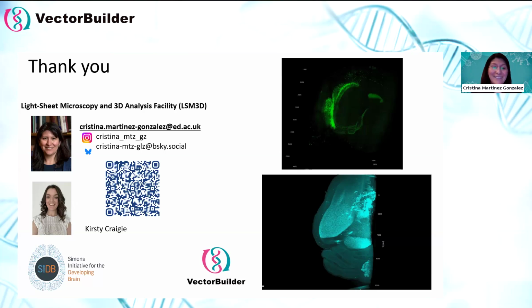Yes. Awesome. The next questions are a bit more general. Are there any common mistakes you see labs make when they first start using tissue clearing that significantly affect image quality or reproducibility? I would say obviously fixation. Start with a good tissue. If the tissue has blood or is poorly fixed, it will not clear well, and the antibodies will not work.